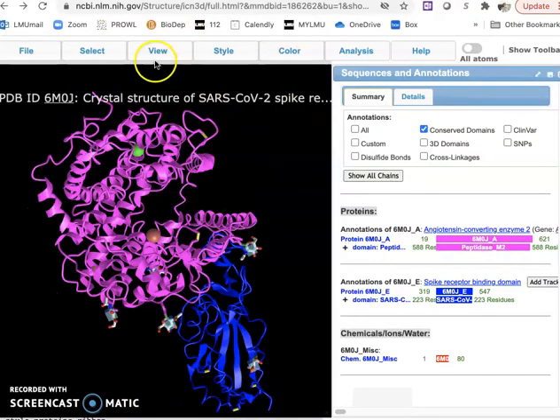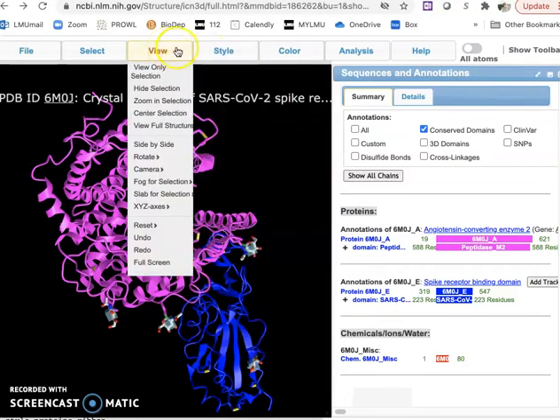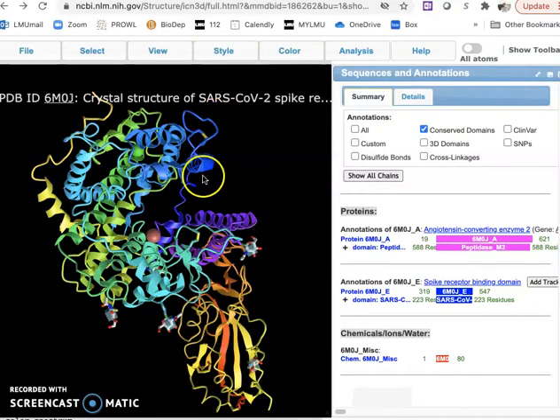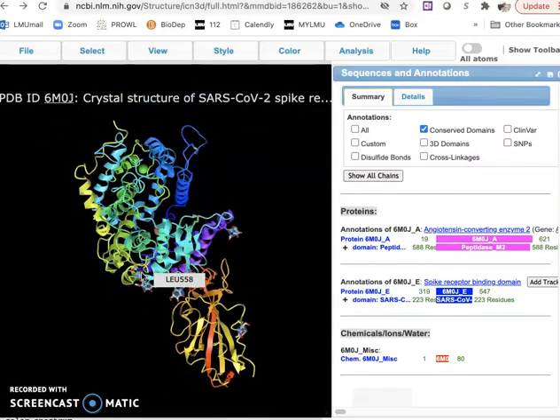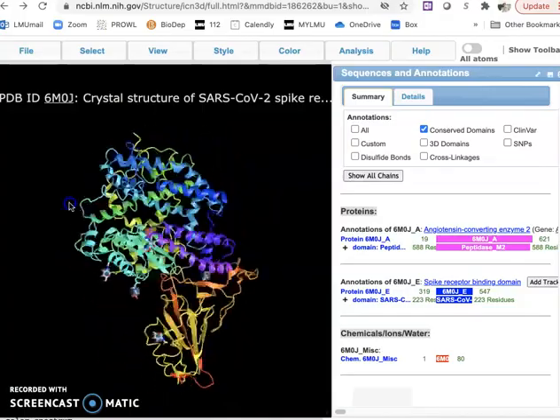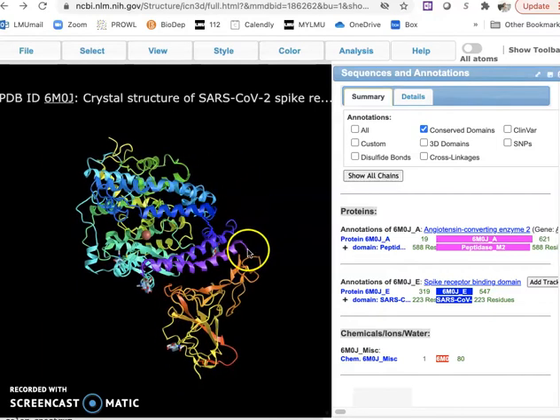We'll take a look at the color spectrum. I really liked this feature. As you could see here, the spectrum is rainbow. It starts with purple, so you can easily locate the end of the protein. This is the N-terminal of the AC2 receptor.